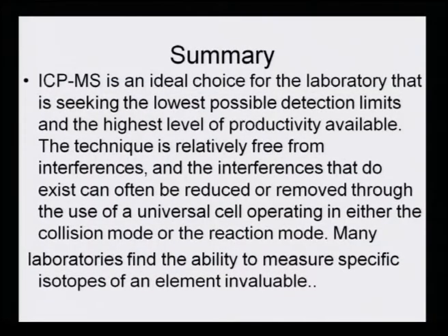So, if we have to summarize and talk highly about this particular instrument, we may surely say that ICP-MS is an ideal choice for the laboratory seeking the lowest possible detection limits and the highest levels of productivity available. The technique is relatively free from interferences, and the interferences that do exist can often be reduced or removed through the use of a universal cell operating in either the collision mode or the reaction mode.